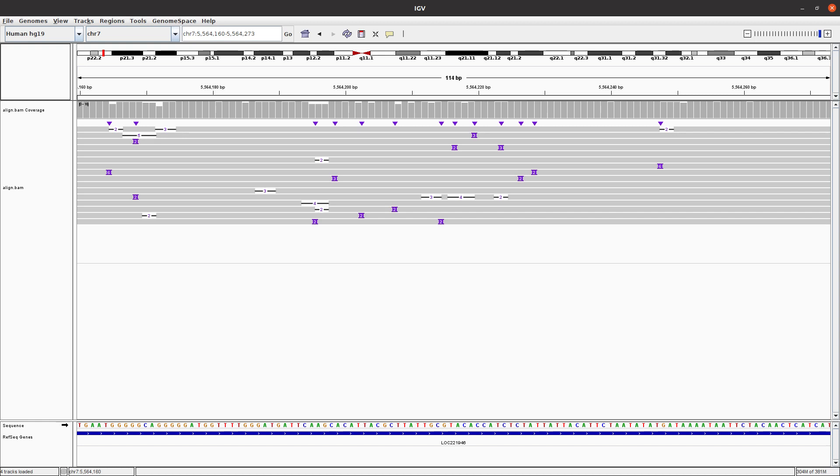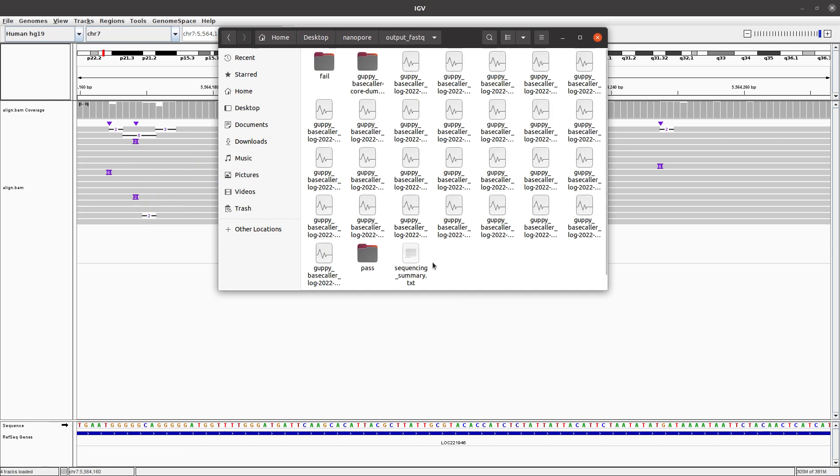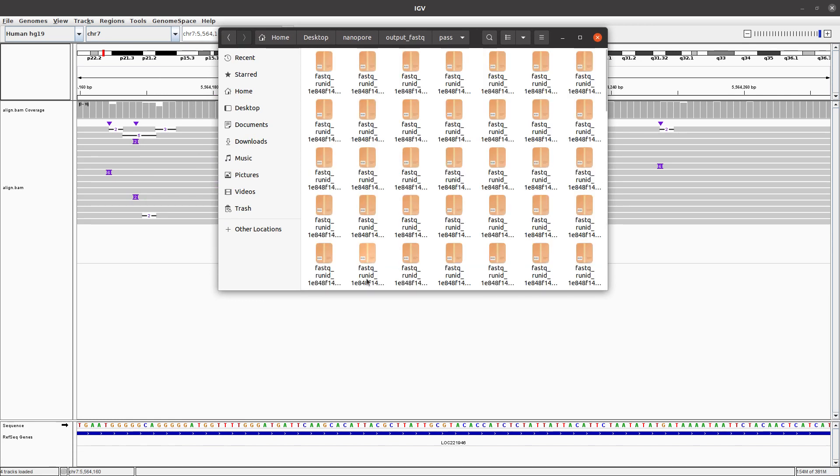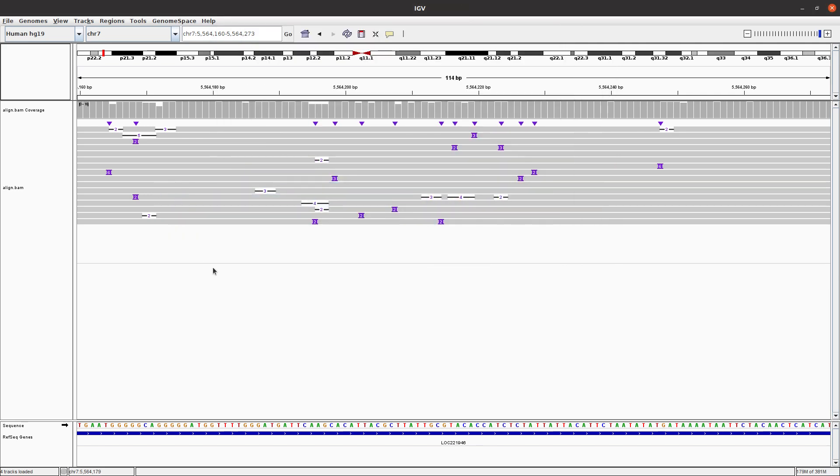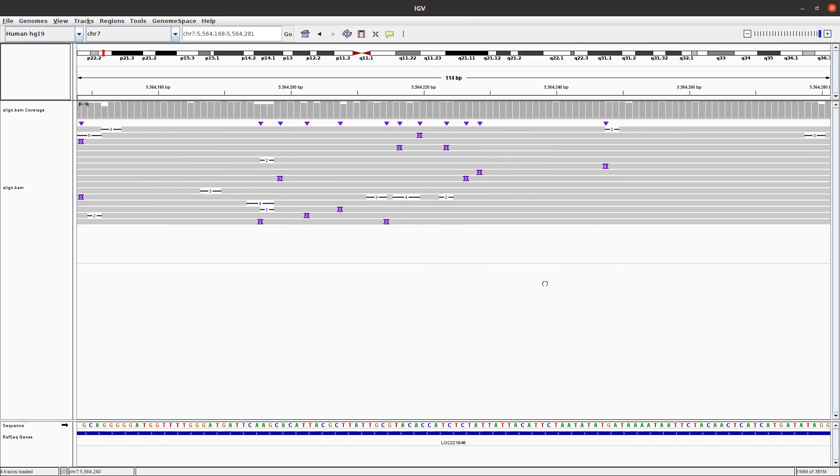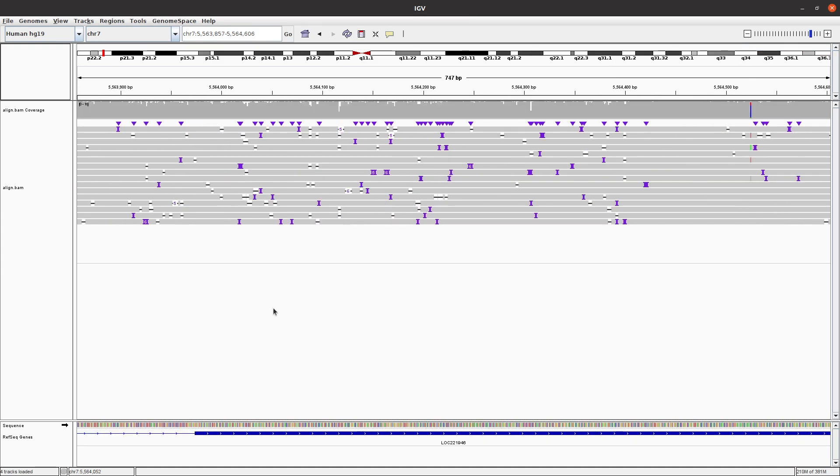Of course, Guppy will save the data in output folder. This output folder will record the failed reads that Guppy could not call, and then the passed. If you open that, you will see your FASTQ files here. Once you align them, you can use IGV to have a look. And basically, that's it.